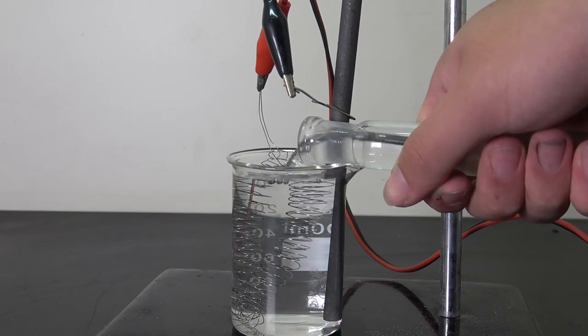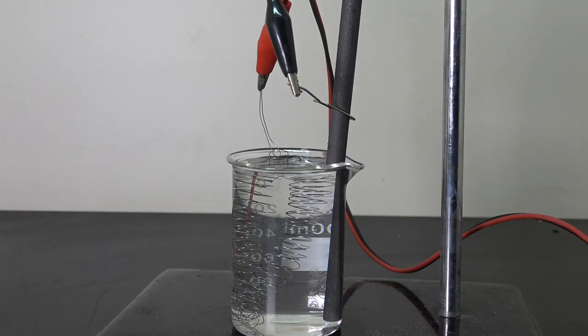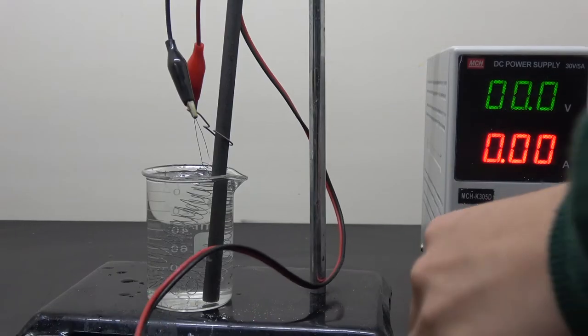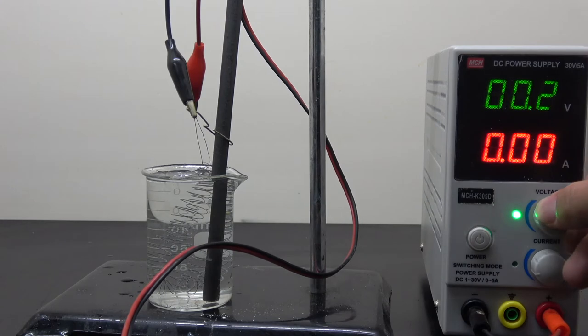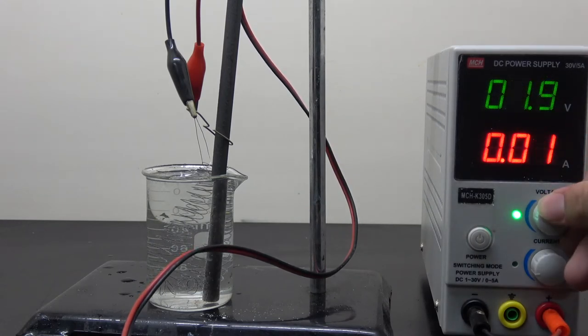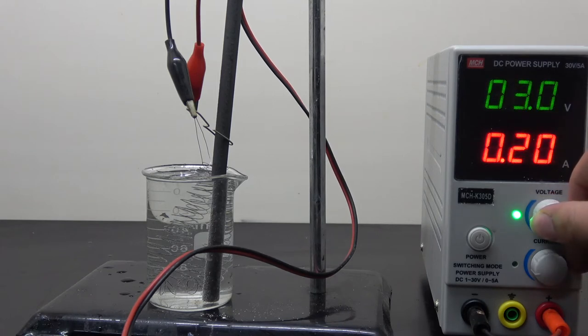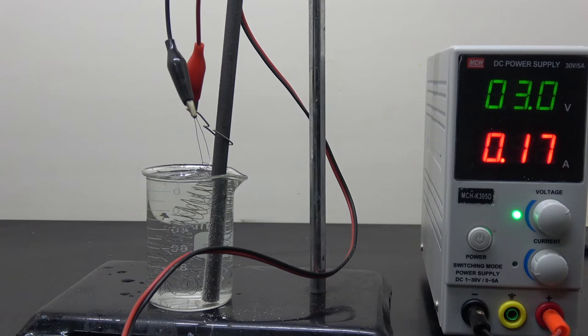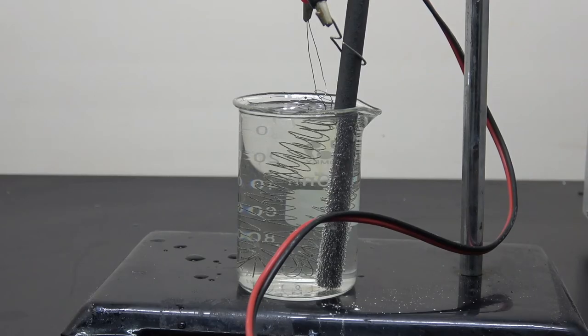I then submerge the electrodes with the acid solution that I just prepared, and adjust the dial so that 0.2 amps of current is passing through the circuit. This serves to remove the oxide layer on the surface of electrodes and expose the fresh metal underneath for later electroplating. Keep the power running for about 10 minutes.